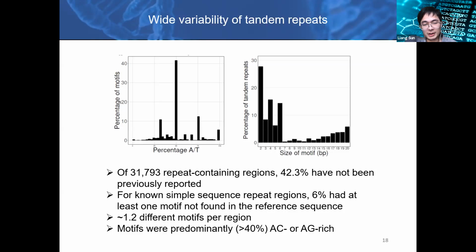So two quick questions. The first is that I know this tool, ExpansionHunter, is mainly for whole genome sequencing. Can it also be used for whole exome sequencing? That's an interesting question. We haven't really used exome sequencing, but in theory it should not work, because exome sequencing is capture based. There are two reasons. One, the capture would have bias, similar to the PCR approach, where it will generate some potential false expansions. The second is that most of the ones we identified so far that contribute to disorders are in the intronic regions. So if we used exome sequencing data, we would not be able to detect most of the ones that we've signaled in our data set here.